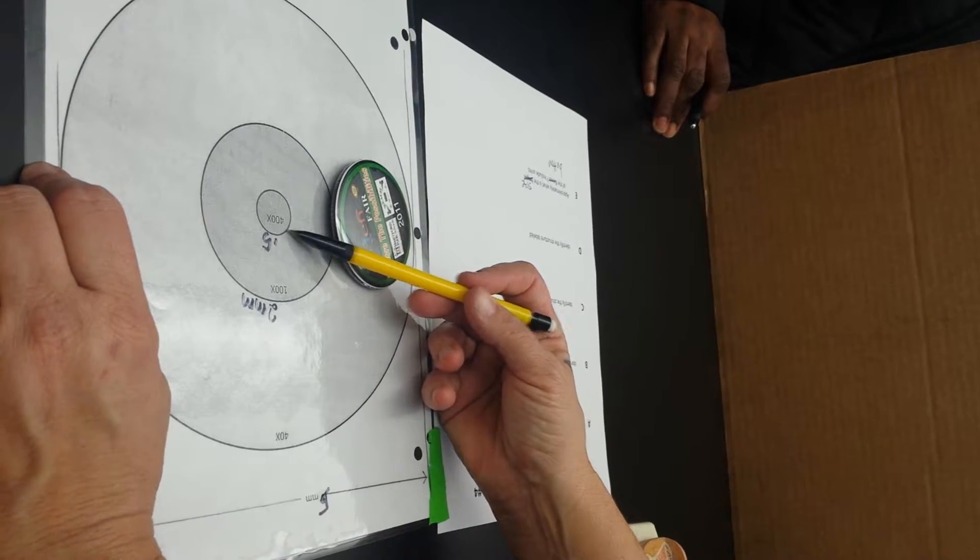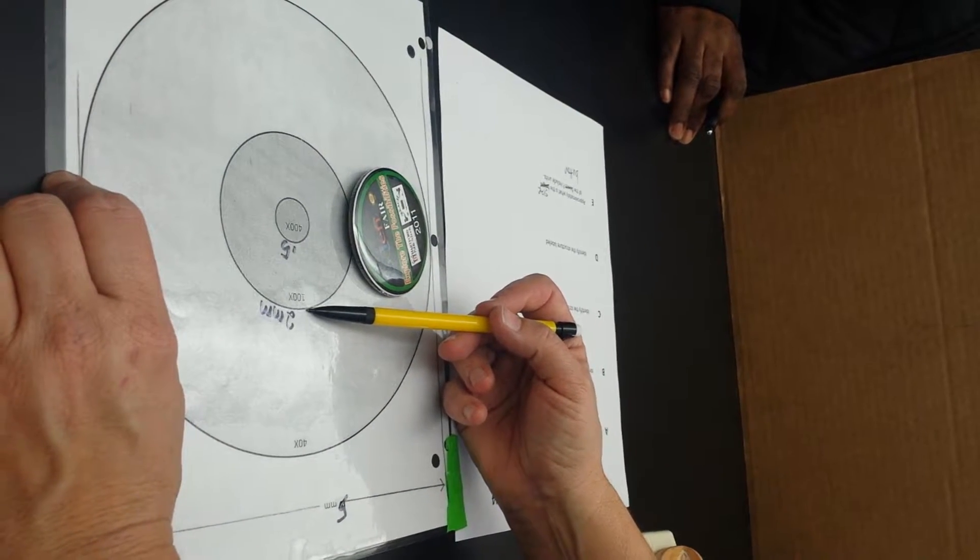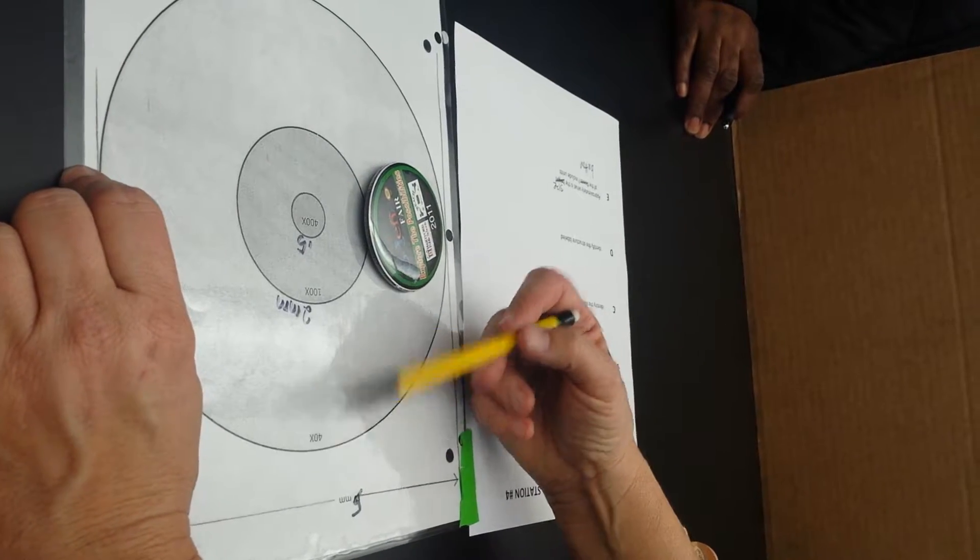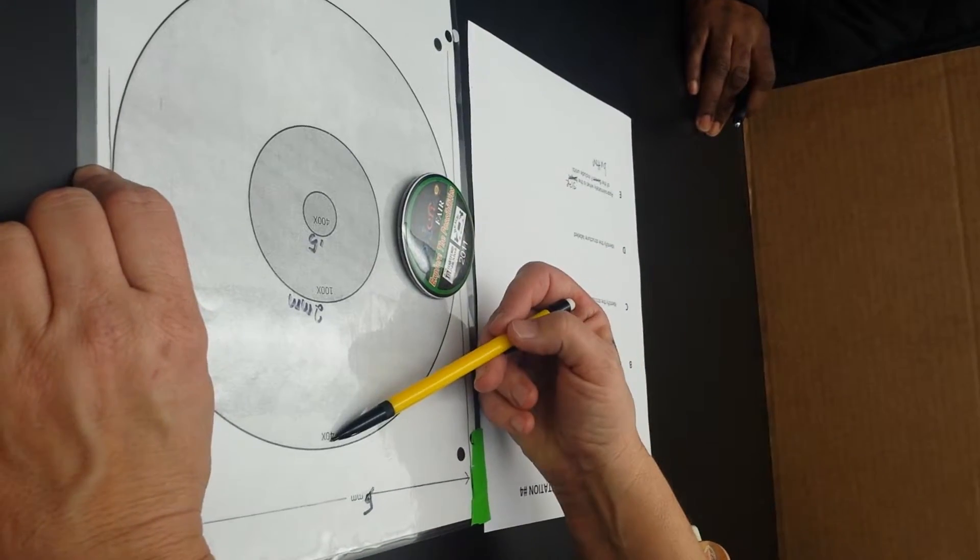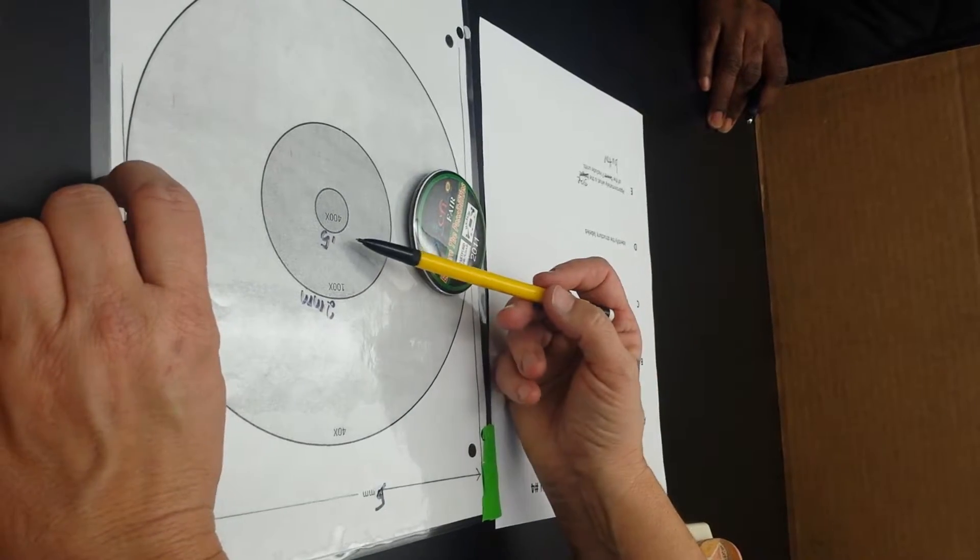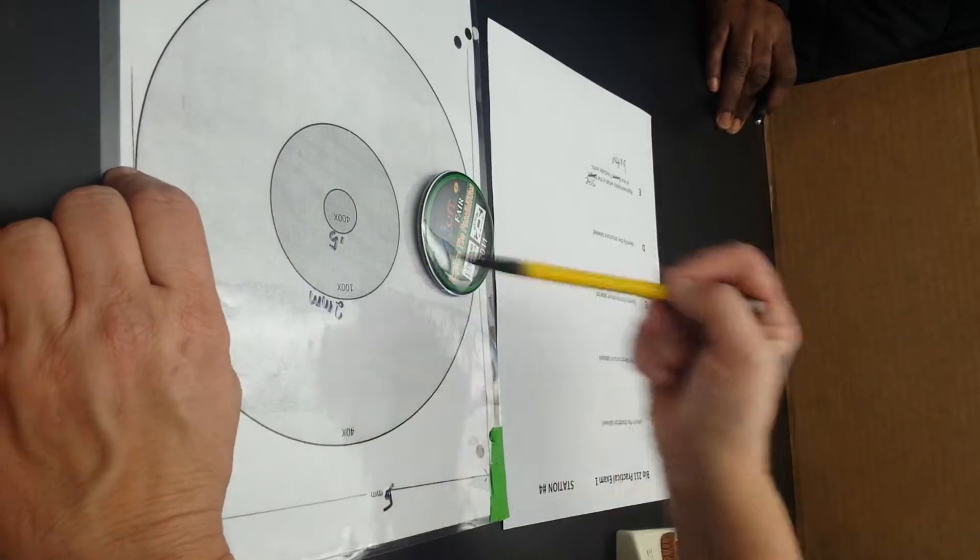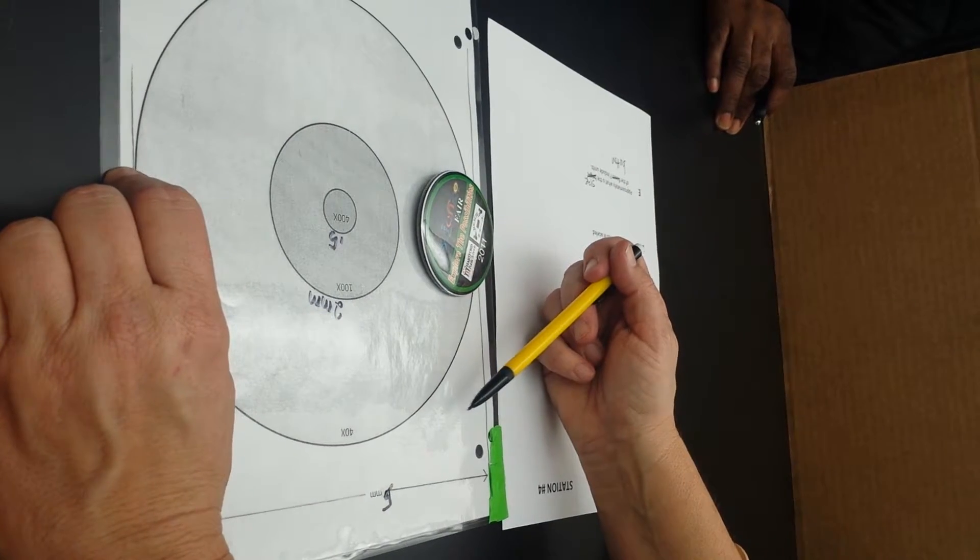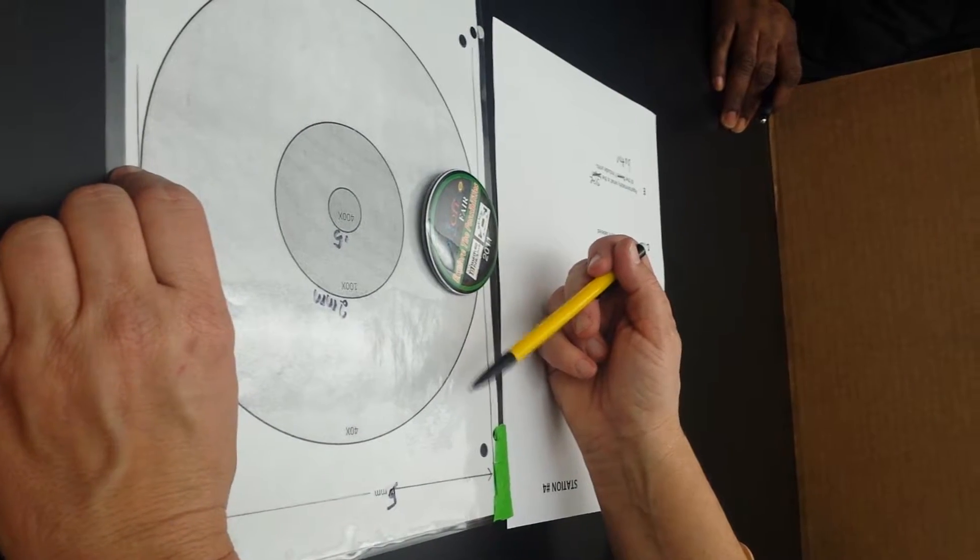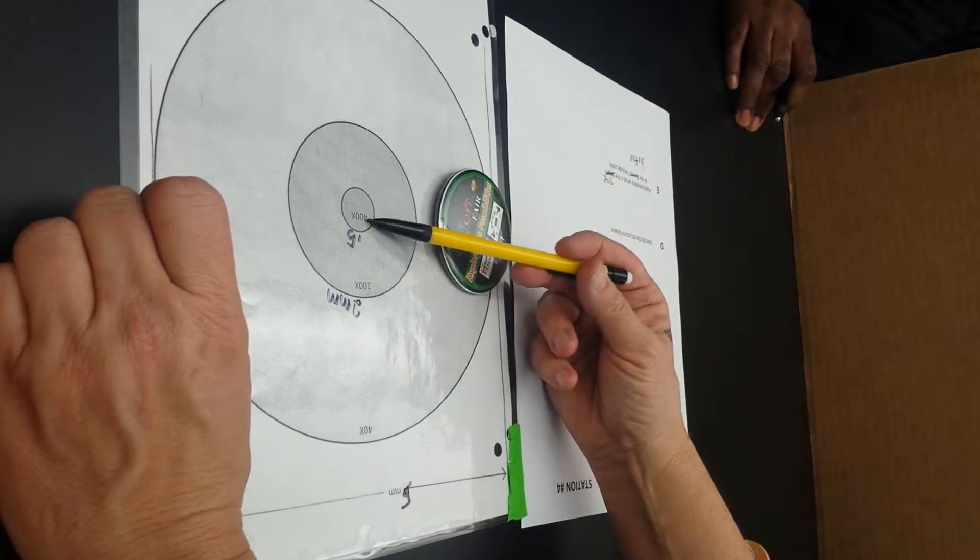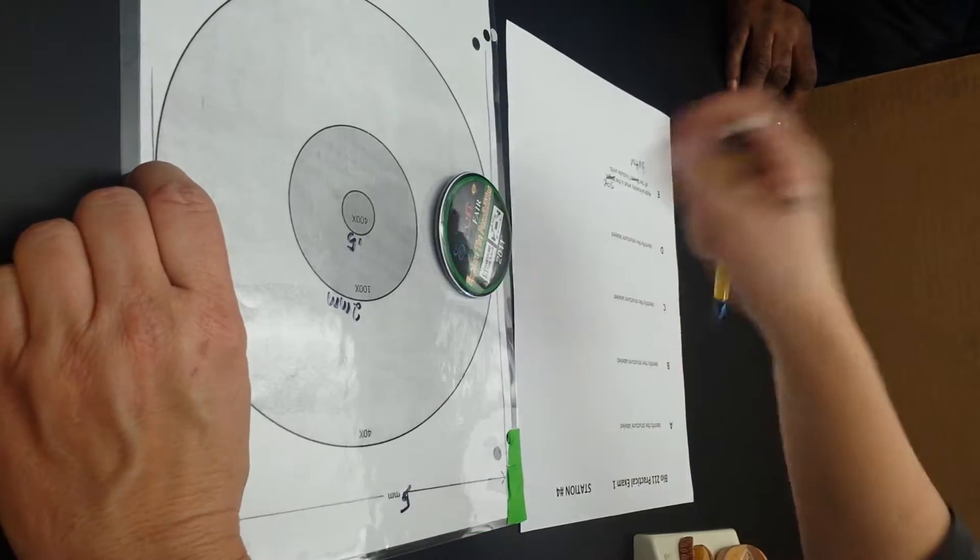And that would be, no, this would not be five. Oh yeah, it would be. That is 10. No, this would be four. Yes. So at 40X, if you could see 10, then this would be, if this is 10, this would be one. Yeah. That's the closer view. Yes. All right. And it's 10 times the magnification and you can see one tenth of the size.